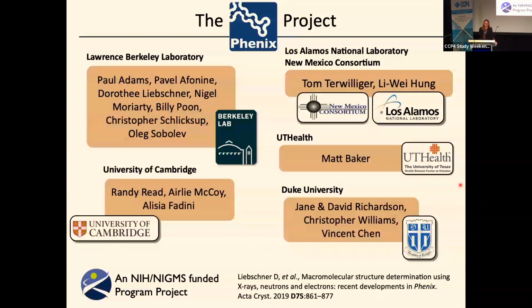Okay, yeah, I think it can predict several structures, but most of them are very similar. So you don't get the conformational variability that you would get if you used homolog search. If these structures are all so similar, then the molecular replacement search will not make much difference.